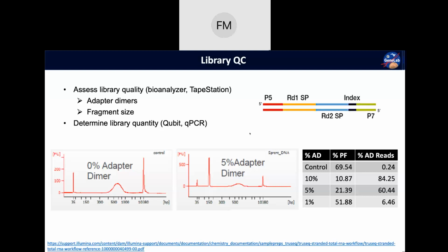And so when we draw up in our pipette from that library pool and put it on the flow cell, the smaller the fragments are that are introduced to the flow cell, they tend to latch on to their complement really quickly, right? Because it's just a small region, this P5 or this P7, that's going to be complementary to the oligos that are attached to the flow cell. So if this is really small right here, you need a smaller percentage of this that's complementary to the oligo, so it's going to find it and latch on, right?